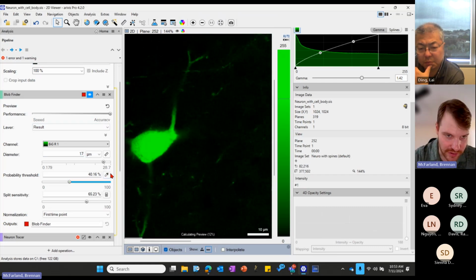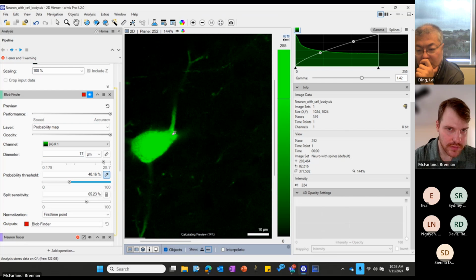You can also use this eyedropper and you can just drag it over a region of interest. Maybe not.